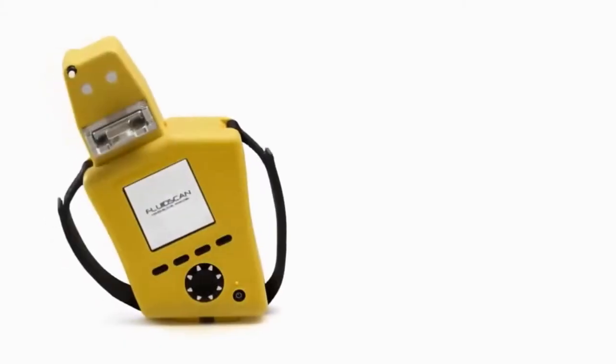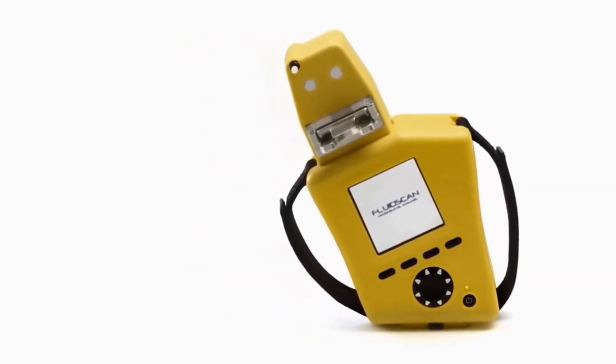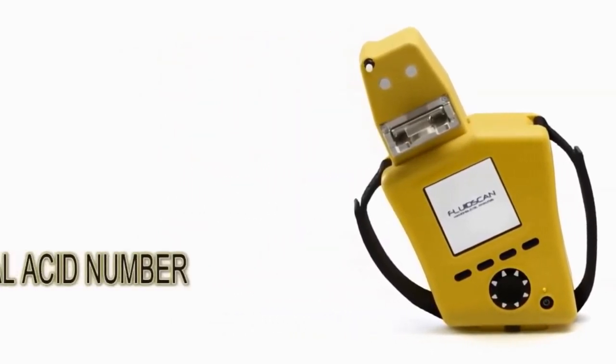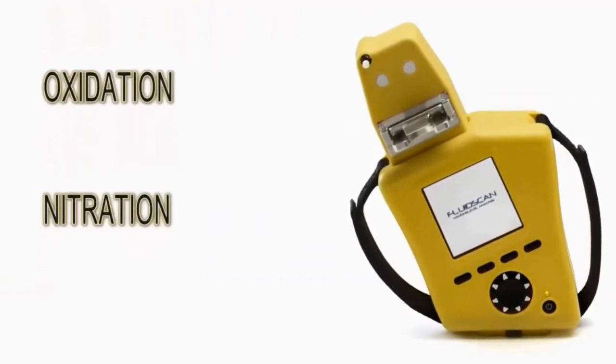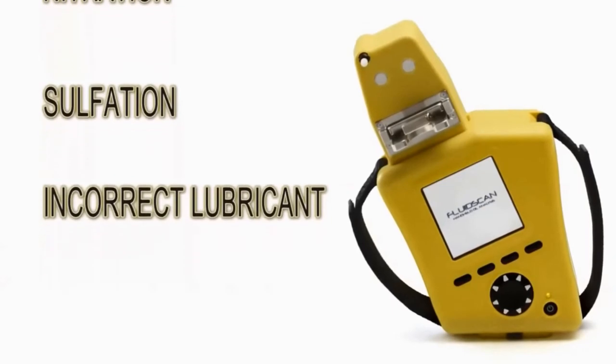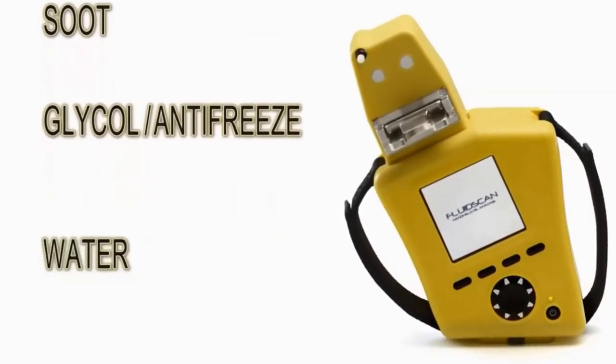The fluid scan provides immediate on-site analysis of lubricant properties and accurately warns the user when it is time to change lubricant. It measures total acid number, total base number, oxidation, nitration, sulfation, incorrect lubricant, additive depletion, soot, glycol antifreeze, and water.